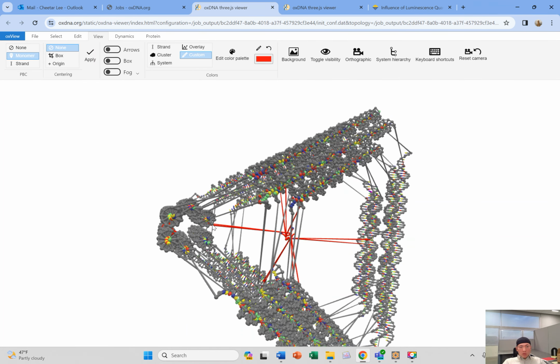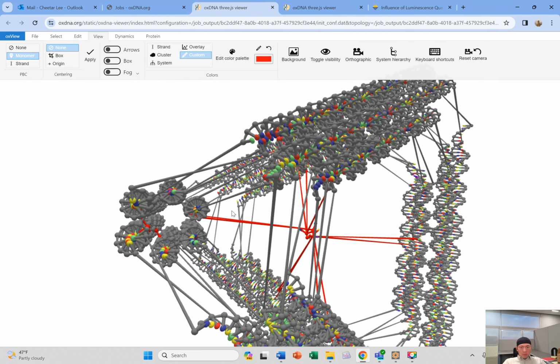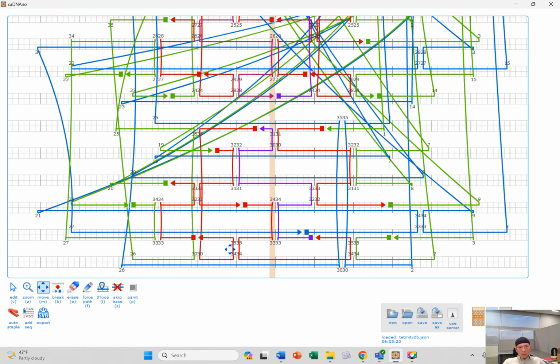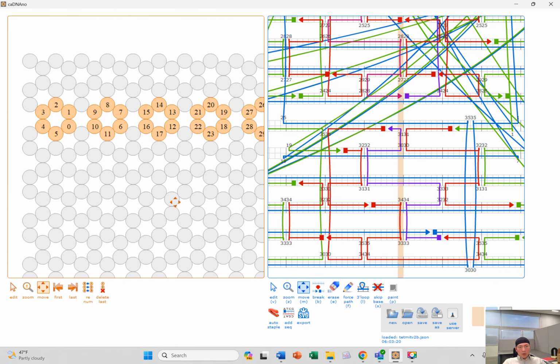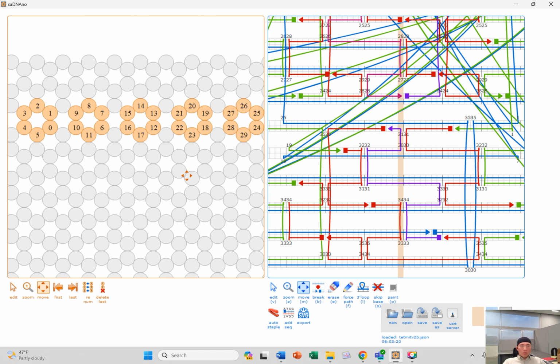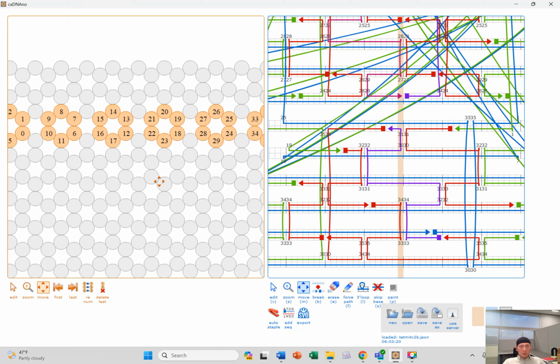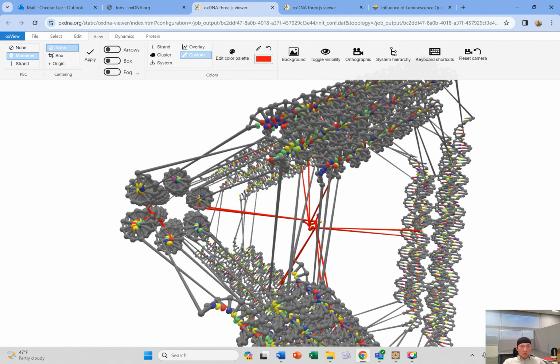Anyways, these can be identified in CAD Nano. First of all, the slice panel will tell us that the program that Talos uses to generate this in CAD Nano always gives us this form. It makes each bundle separately. It's a tetrahedron, so there are 6 sides, so there are 6 bundles.